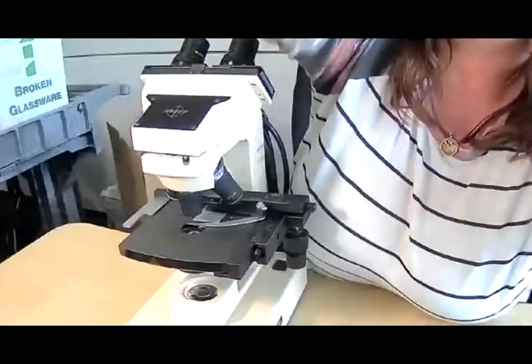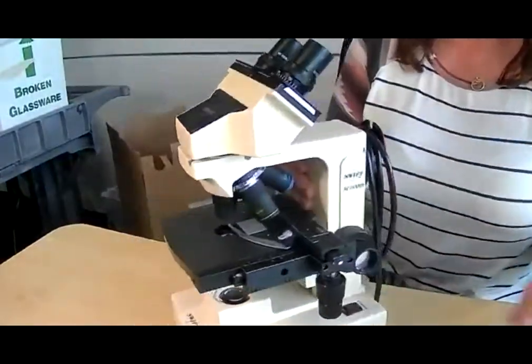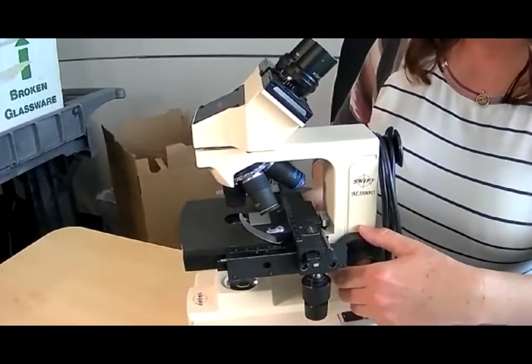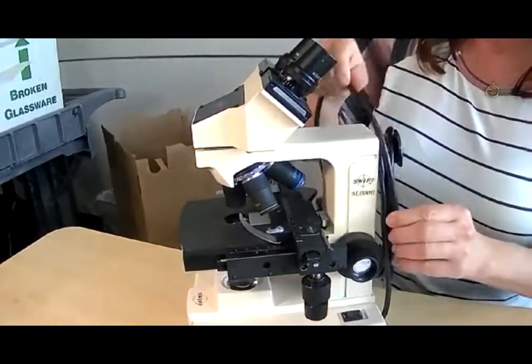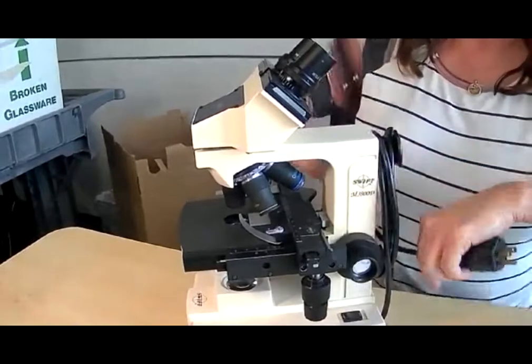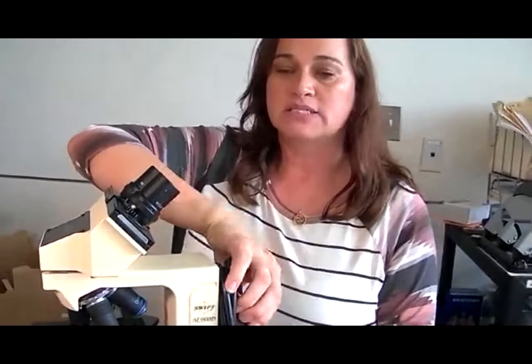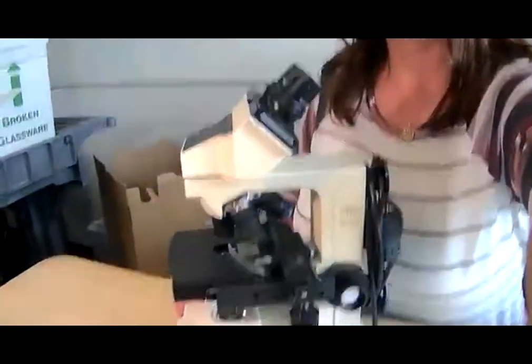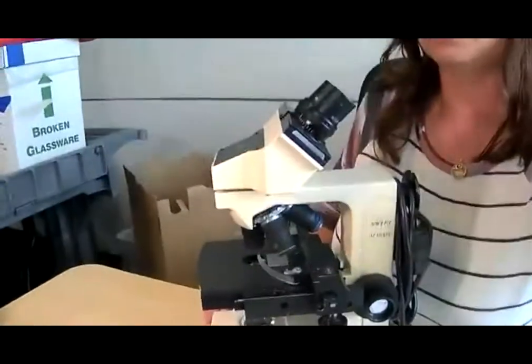I'm going to increase this here so you can see it better. Forgive me, my camera is not going straight at it. So when you're putting the microscope up, you need to, again, fasten the cord all the way around because you do not want to have any hanging cords. If the cord is not fastened and it's hanging, it is not put up correctly.